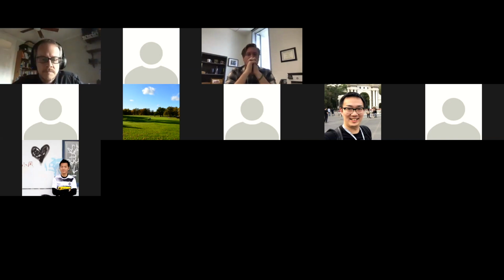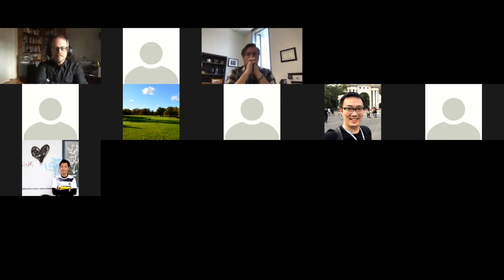Yeah, thank you very much. Maybe I can comment if it's okay. We also did the zeolite where we had 4 different phases on the grid, and we did it at room temperature as well. So it's possible to separate phases. One of the powerful things about MicroED is that you can do phase analysis on the grid. There is also a technique called serial electron crystallography. We collect one diffraction pattern from one crystal on the grid, so we can go through thousands of crystals per hour, analyze their phases, and collect 3D data from them if possible.